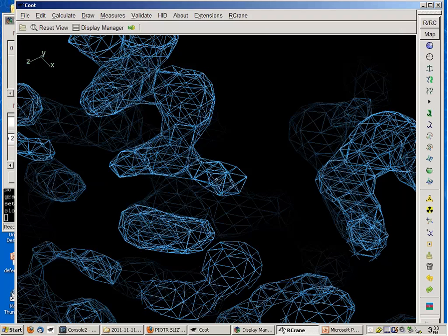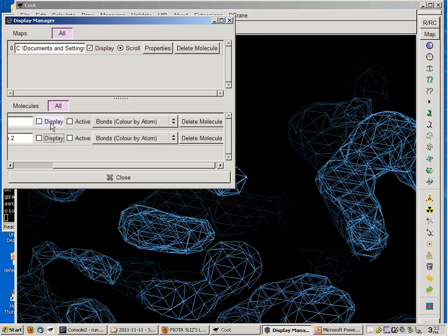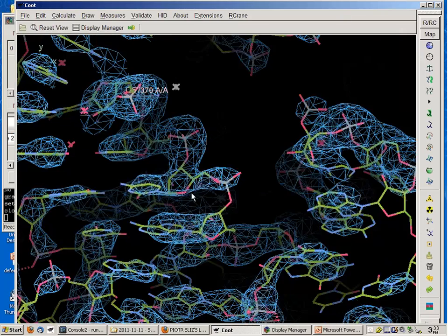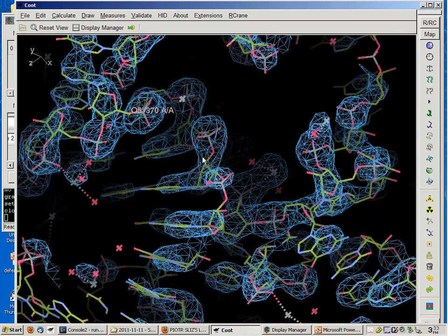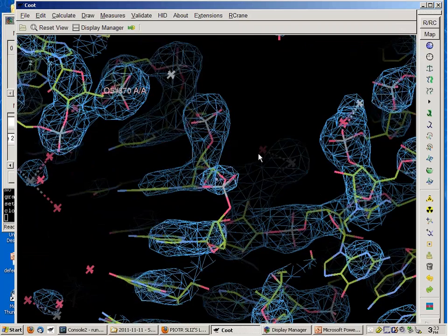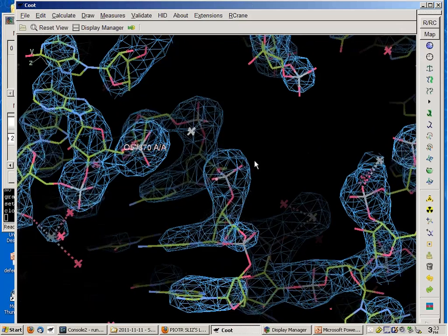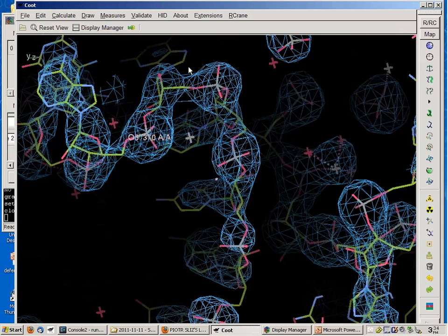Delete trace. The other thing you can do with RCrane, I'm going to pull up the published structure again. So this is a molecule I didn't build with RCrane, but say I had just finished running refinement on a molecule, or I just finished running through MolProbity, and there's a section of the molecule that doesn't seem to match the density, or MolProbity has told me that I have sugar pucker errors or steric clashes, I can use the rotamerize existing structure feature.